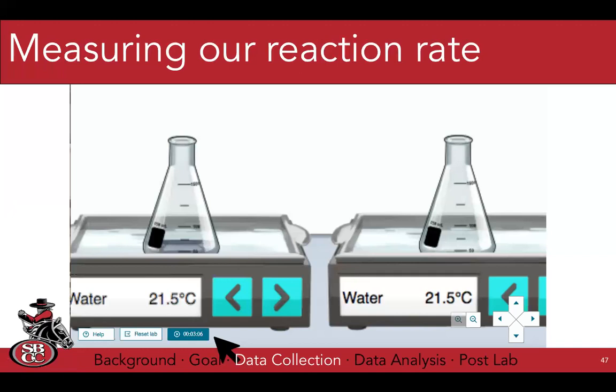You don't. If we were in a regular lab, then we would have a water bath and we would be monitoring the temperatures. But these water baths are constant temperature baths. They keep the water at a constant temperature, given to us at 21.5. Because it's a simulation, we just assume perfection, that it's working.